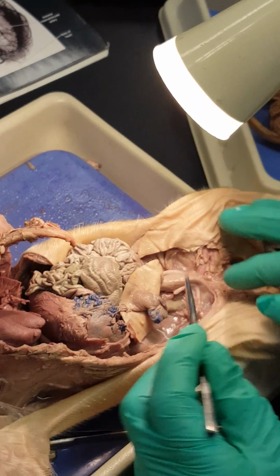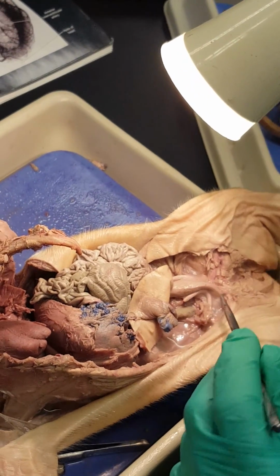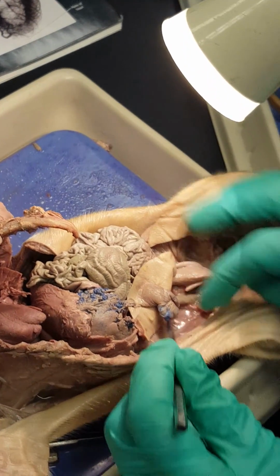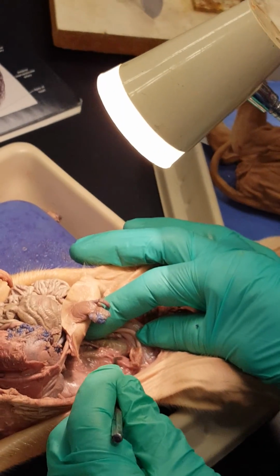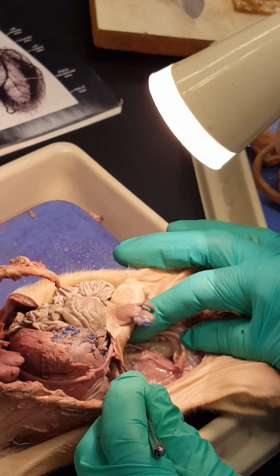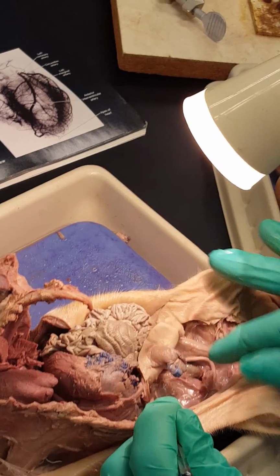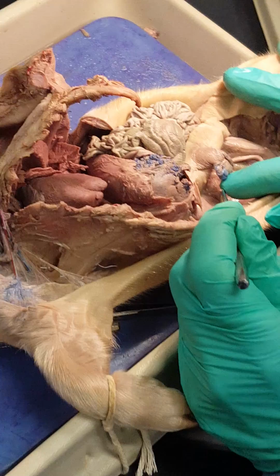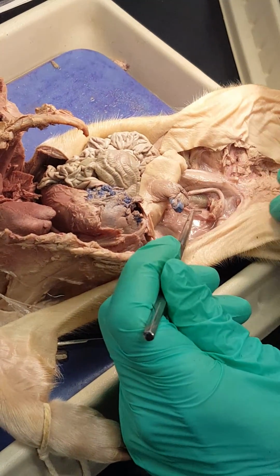But these two arms come together into the body of the uterus and then onto the vagina, which is behind the urinary bladder. But there is an ovarian artery here running from up here. And in the human, that artery actually branches off of the renal artery. Because in embryonic development, the uterus begins up there, close to the kidneys, and then migrates down. And so the artery just follows.